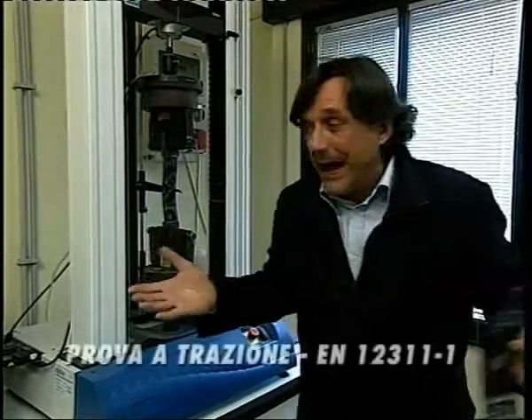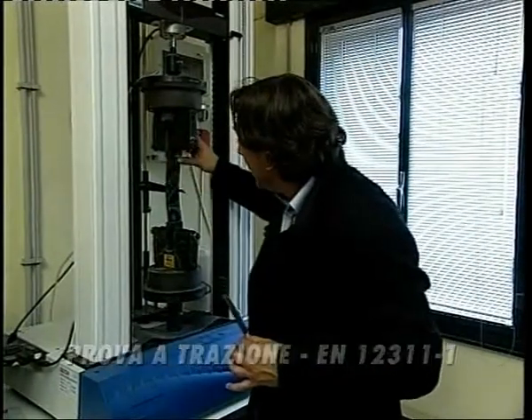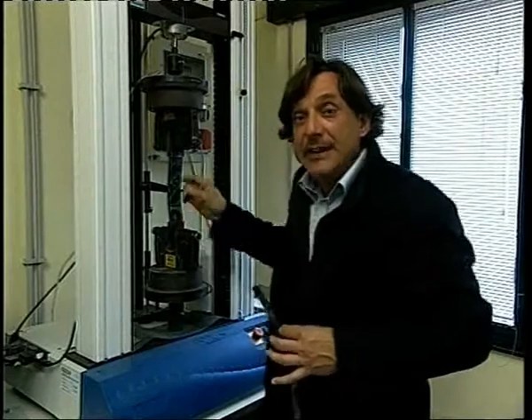This test is regulated by strict norms and must be scrupulously conducted. These spindles are 5 centimeters. And for this reason, the mechanical strength value that you see indicated on the technical data sheet is expressed in newtons per 50 millimeters or 5 centimeters.